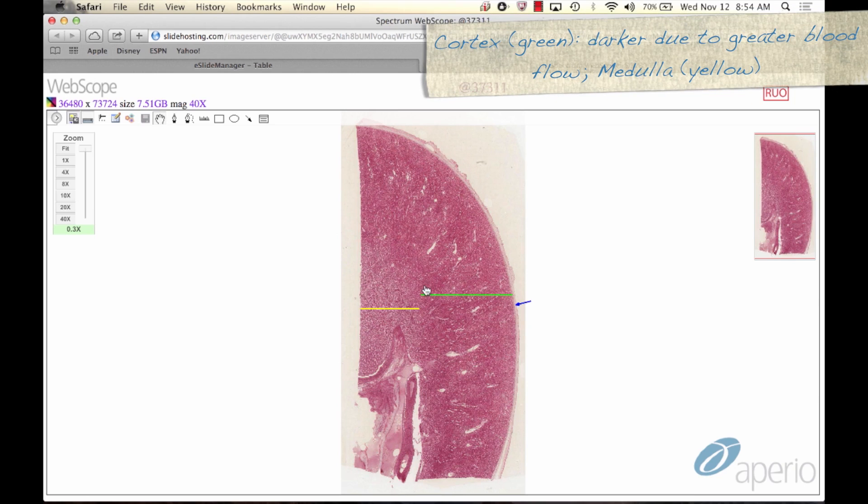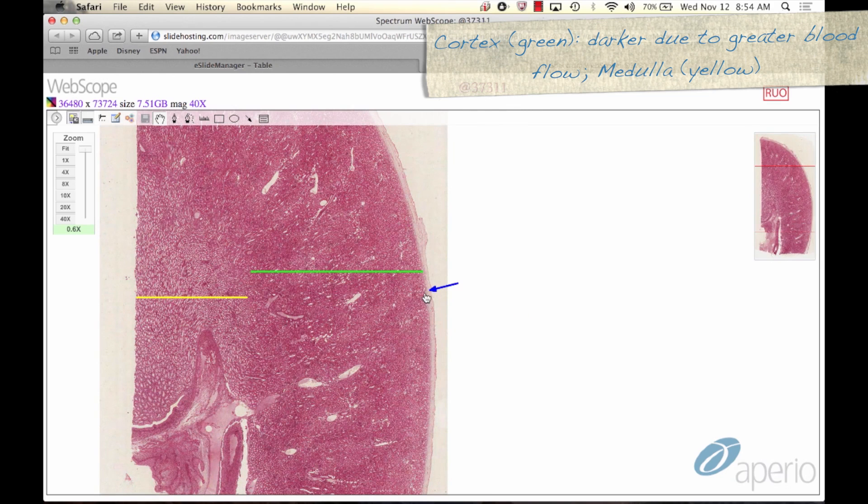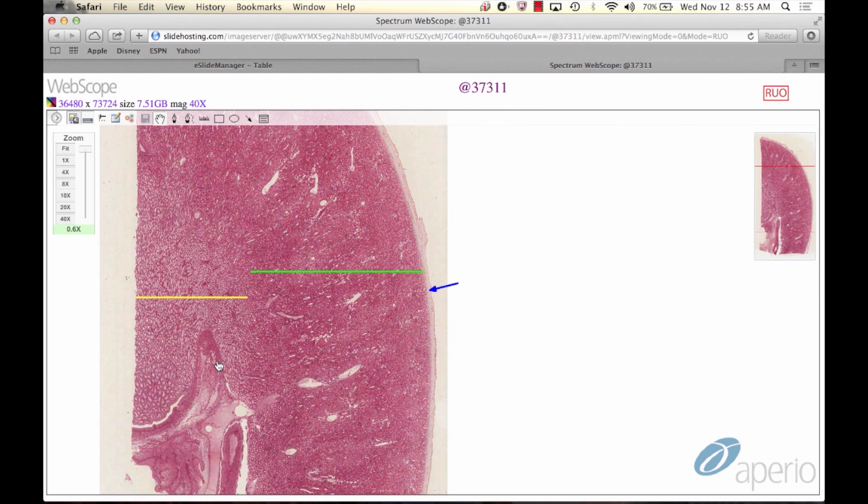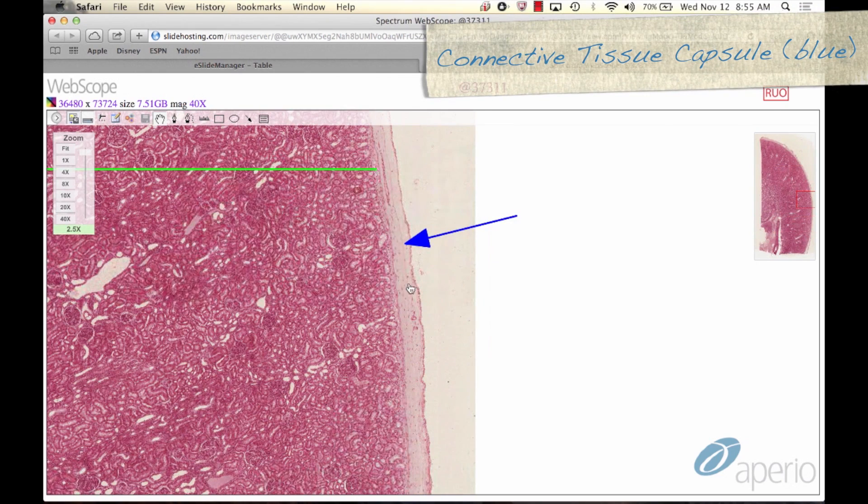The kidney has a darker staining cortex, seen here spanned by the green line, and a lighter staining medulla, spanned here by the yellow line. The cortex stains darker due to greater blood flow. Zooming in, we can see the connective tissue capsule at the blue arrow.